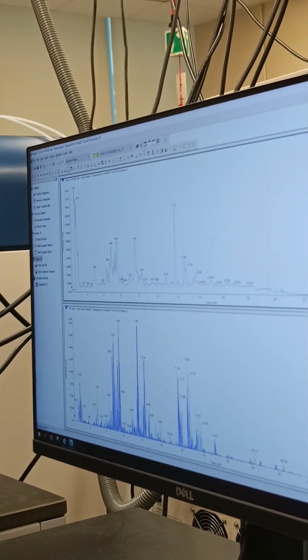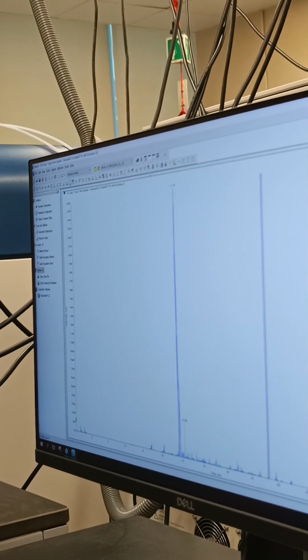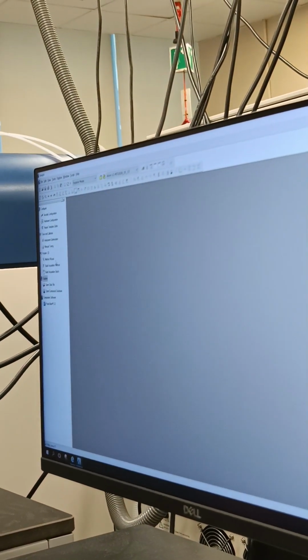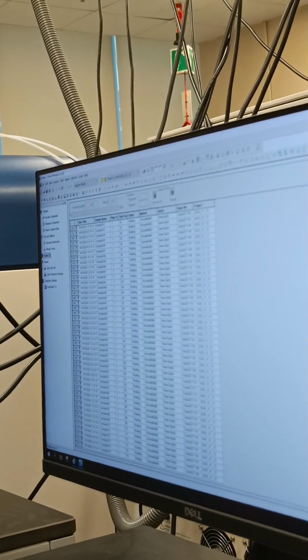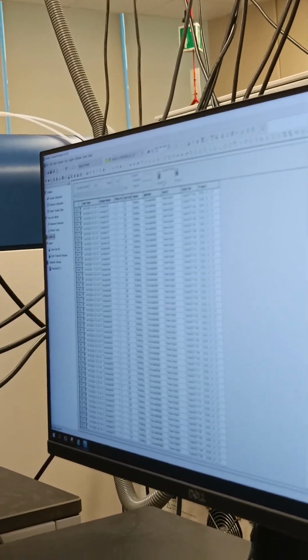Okay, so this was everything. Let's go back to this. Okay, it's still warming up. While it's warming up, I can load my samples into the rack.